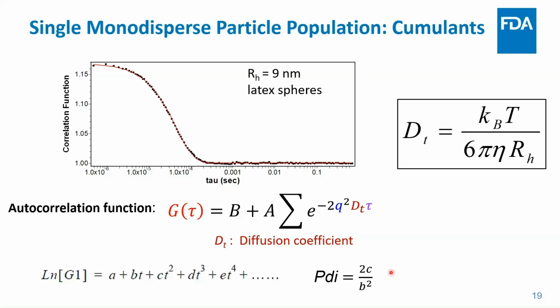So when you think about the polydispersity index or the distribution of a typical Gaussian distribution, you're like, okay, the mean is the center, and one standard deviation is this wide, or you could use full width half max to calculate the standard deviation, and use that to figure out what the PDI is. In this system, it's actually calculating the PDI directly from the exponential decay.